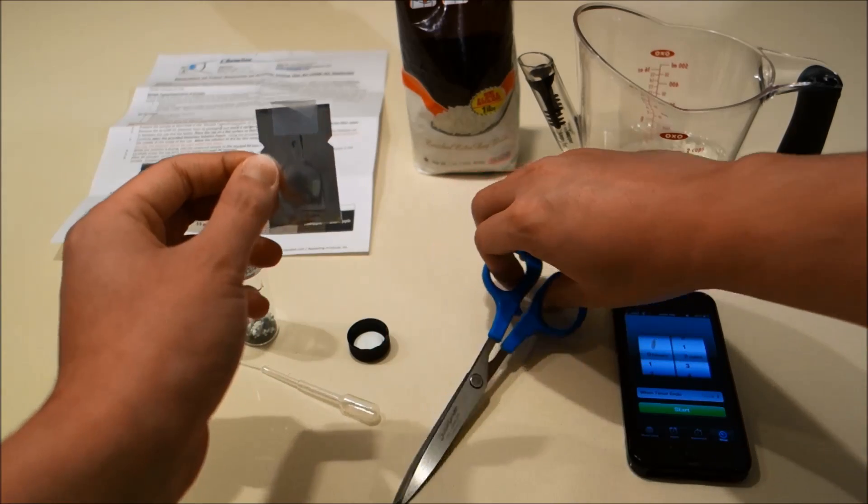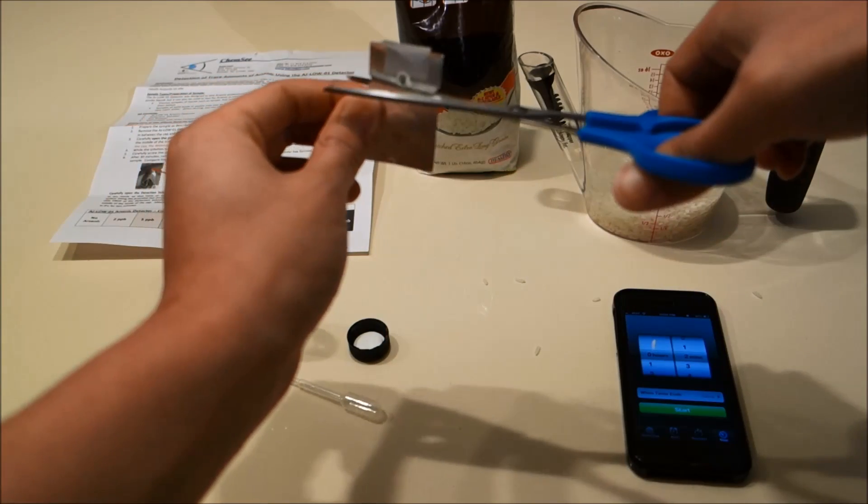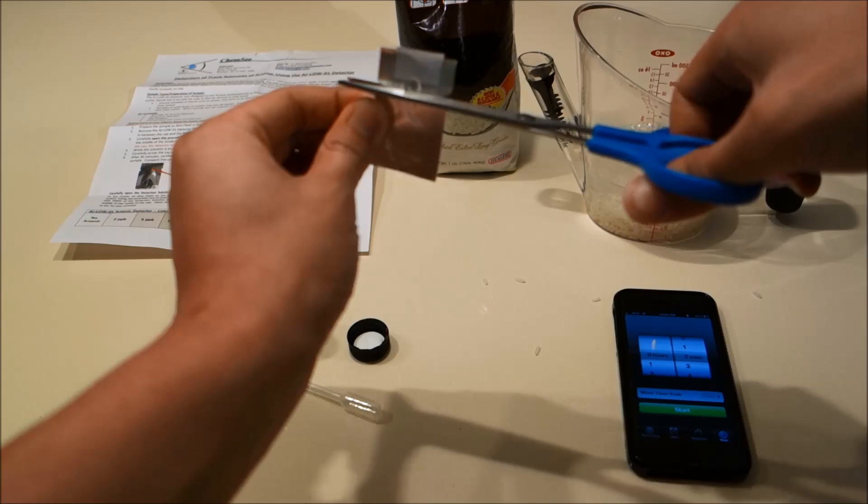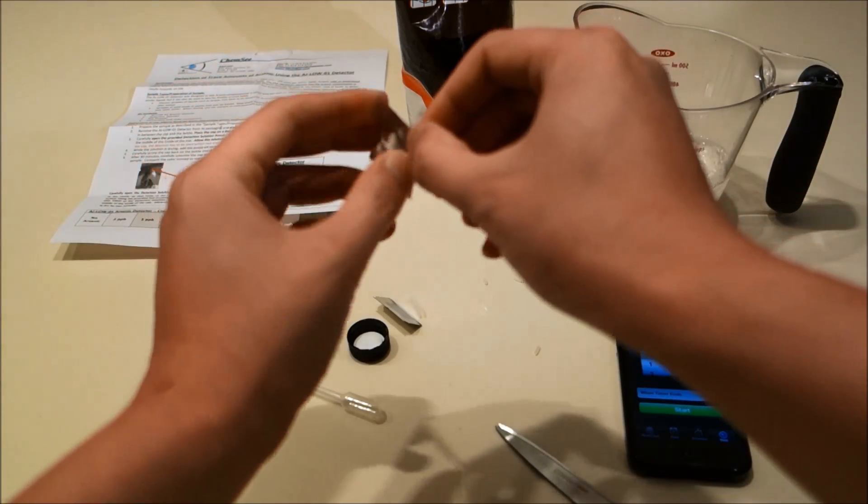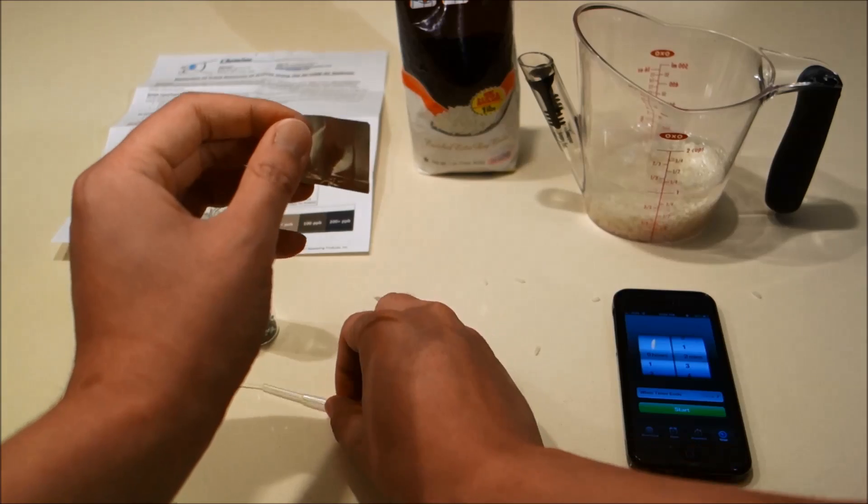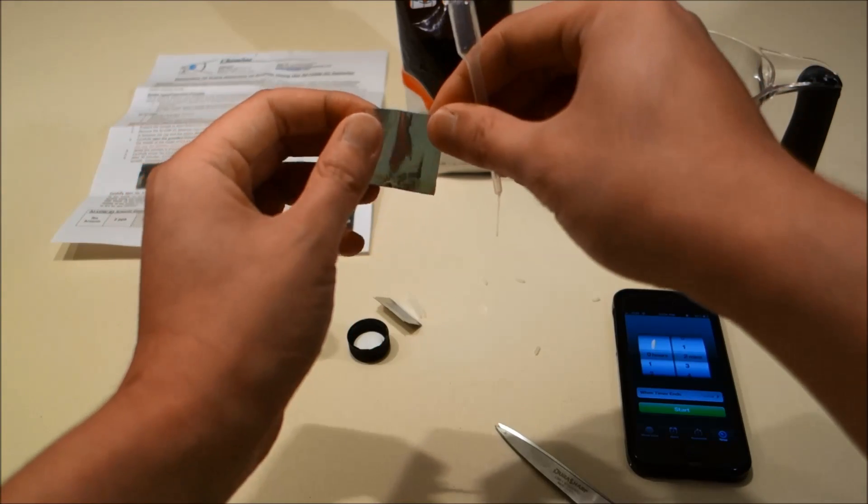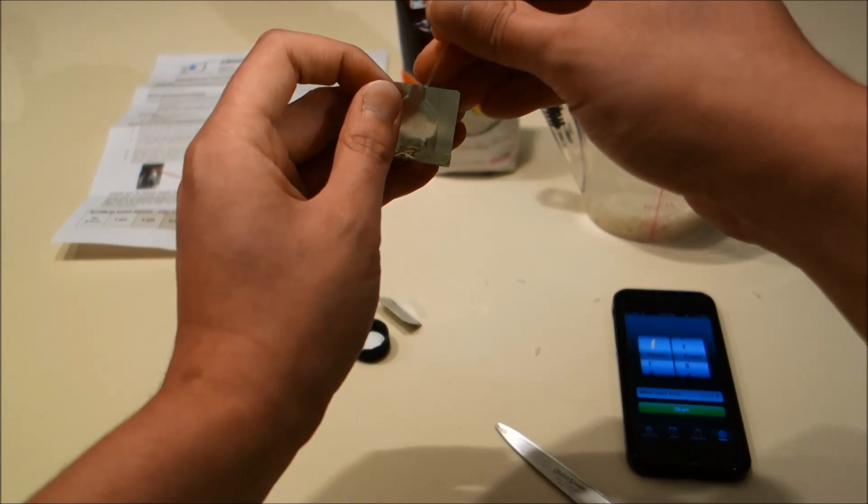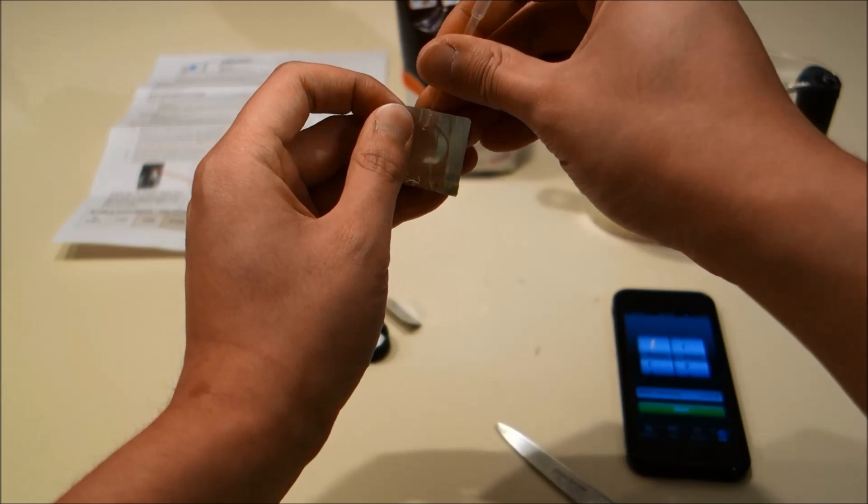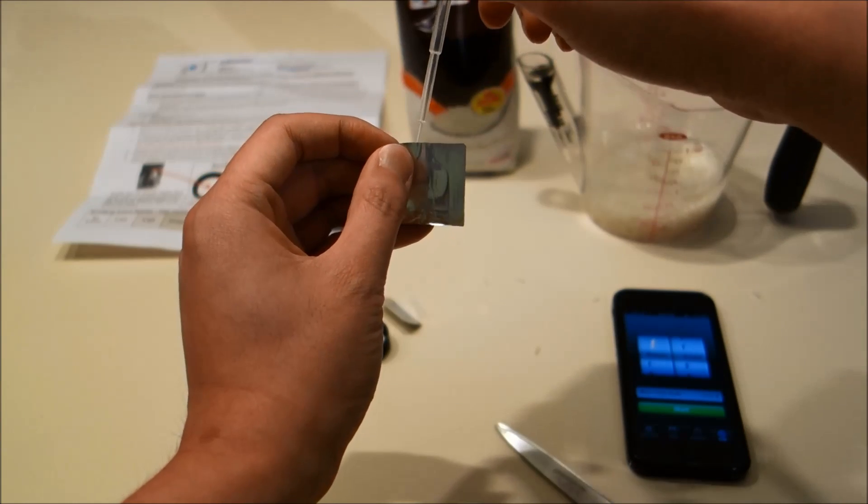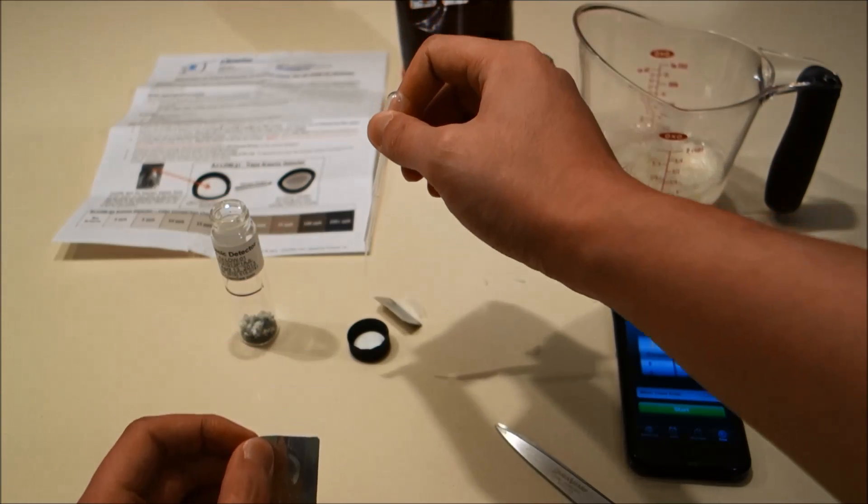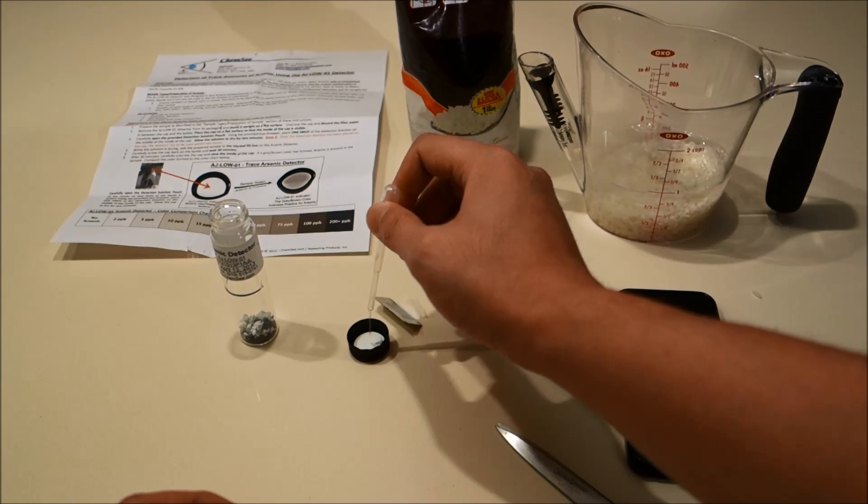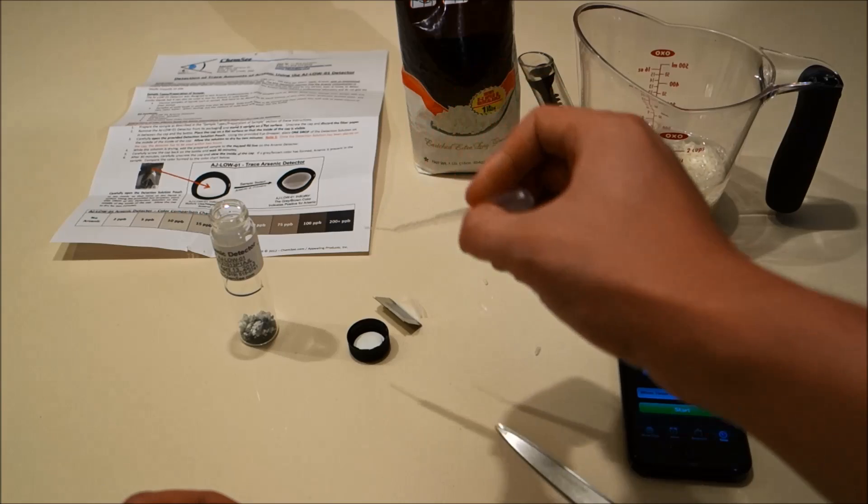Now using the scissors, carefully cut open the solution pack. Next, use the included eyedropper to take out one drop of solution and carefully place a single drop in the cover.